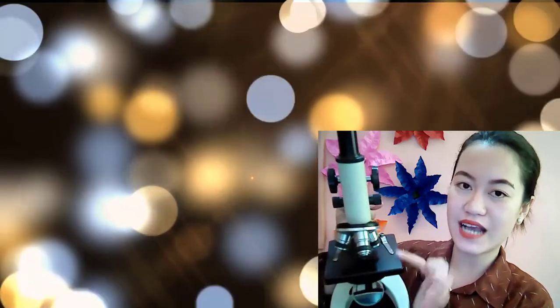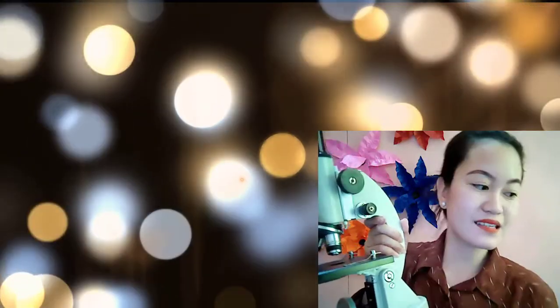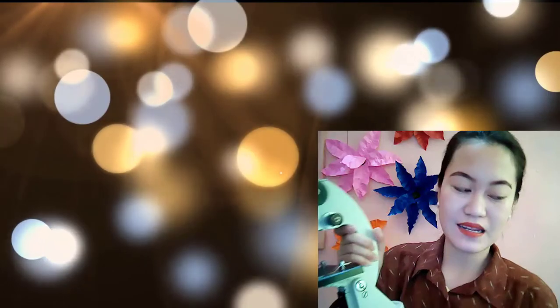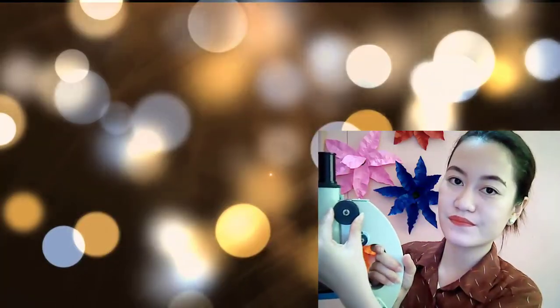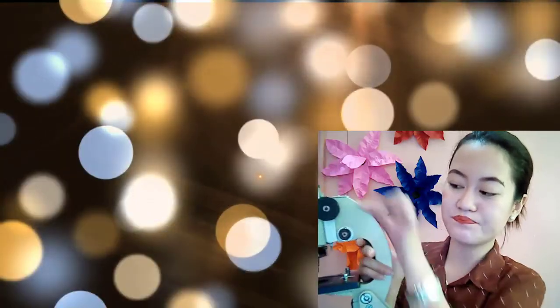This is the stage class. This is the stage clip. And this is the sliding glass where we put the specimen. And of course, we have here the coarse adjustment knob. And this is the fine adjustment knob. And this is the arm.